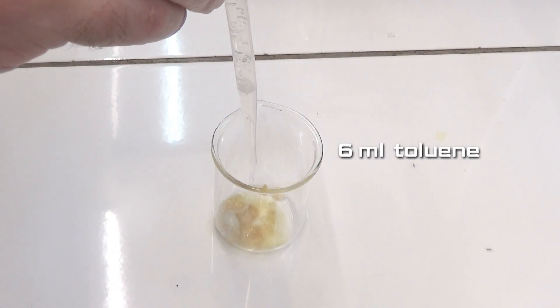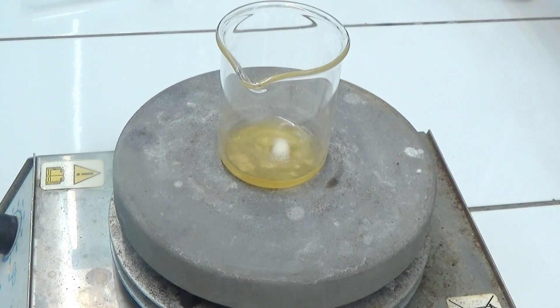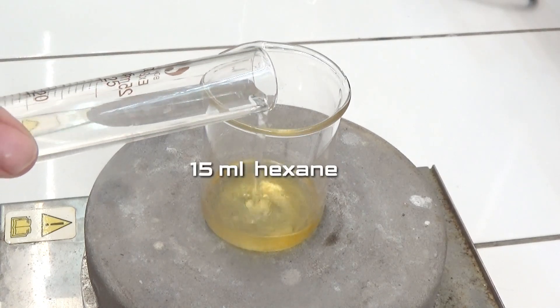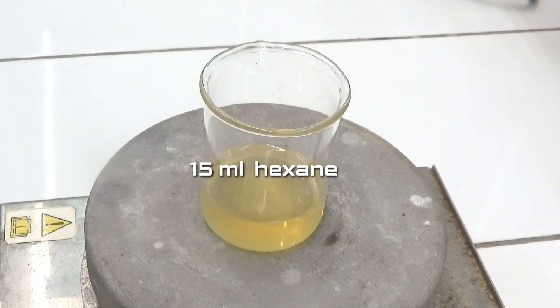Dilute the crystals with 6ml of toluene, heat slightly until total dissolution. Let cool and add 15ml of hexane and leave in the refrigerator one day at 0 degrees to crystallize.